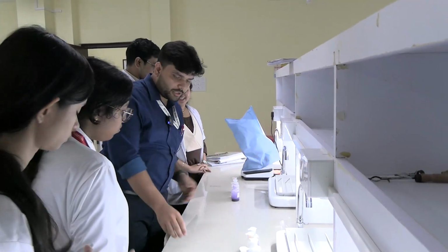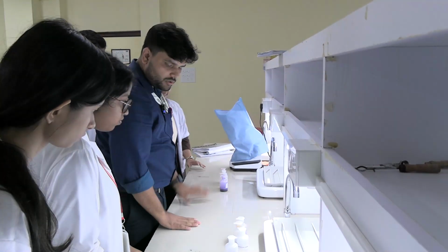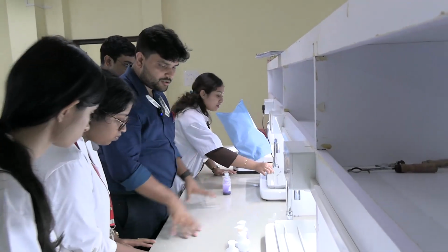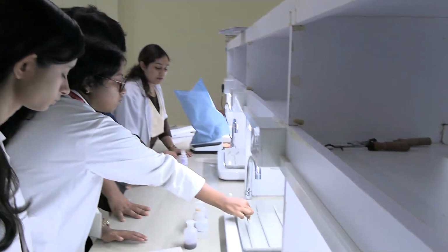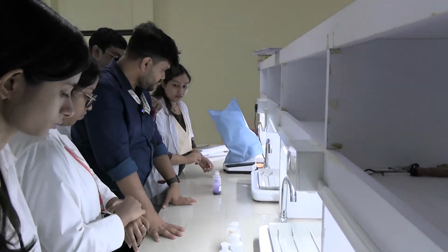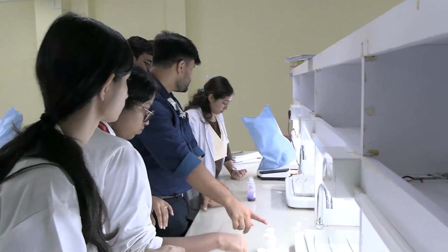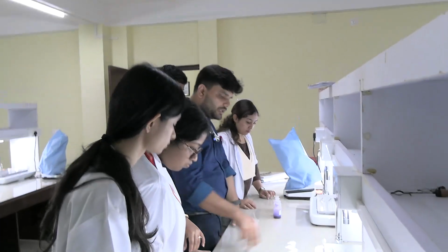Okay, come here. First of all, this is a staining rack, you guys know. So put the slide in the staining rack. We'll be giving you full hands-on, okay? Do you have the watches? All of you have watches, so make sure you keep the time. Remember, the time starts from the first drop that you drop, okay?